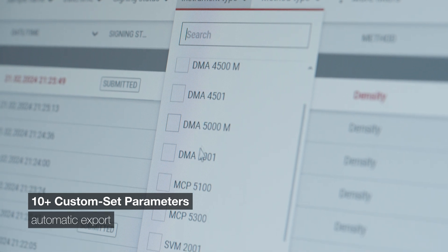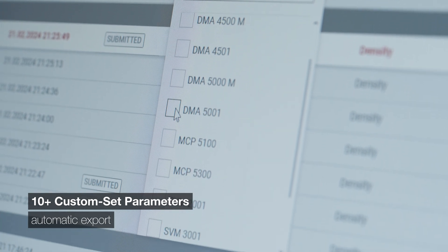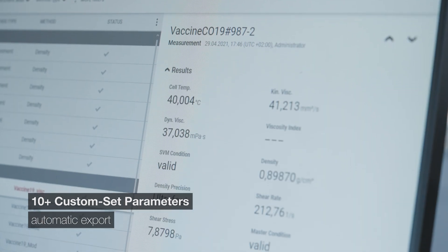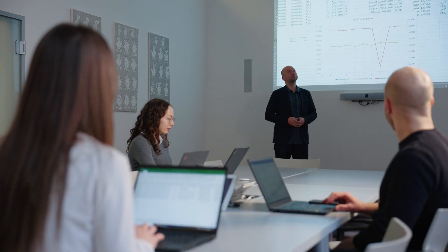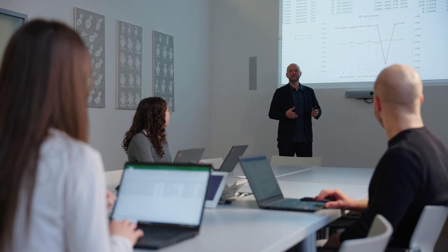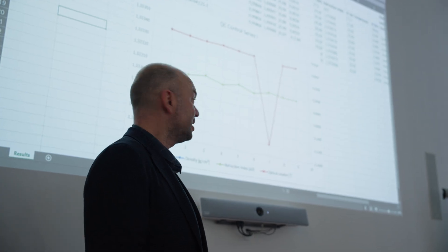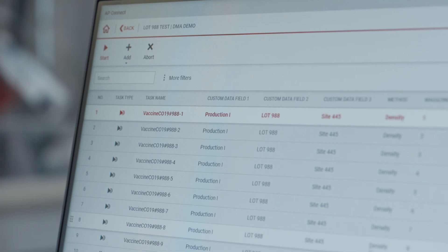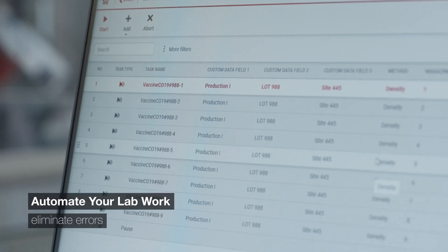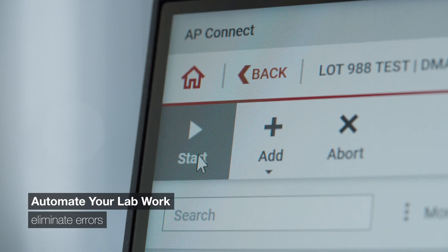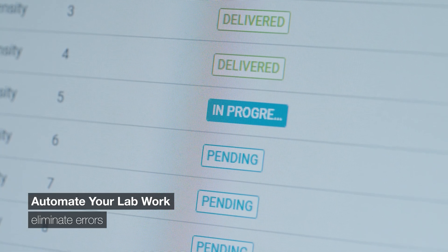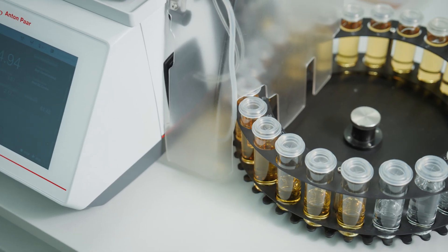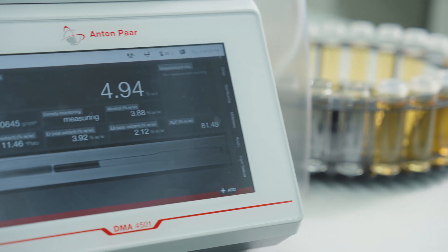Filter data by custom set parameters. Create the data sets you need. Export them automatically and seamlessly transfer them into your LIMS. Automate your lab work centrally with remote-controlled task lists for your lab instruments, safe from user error.